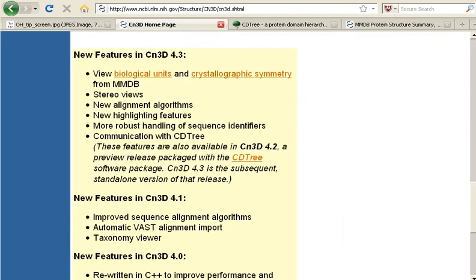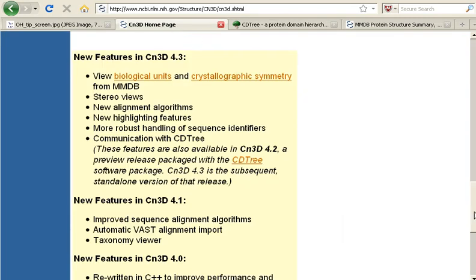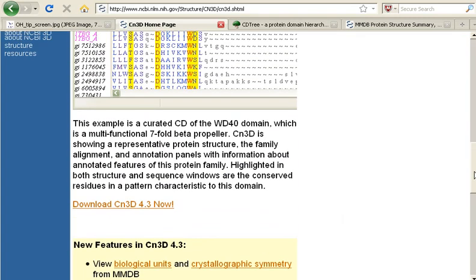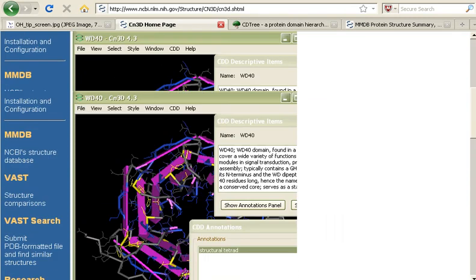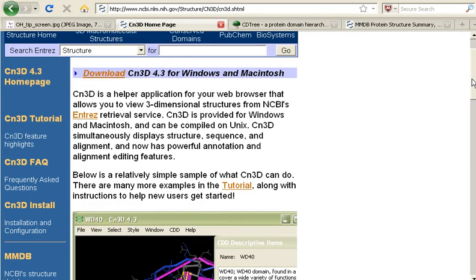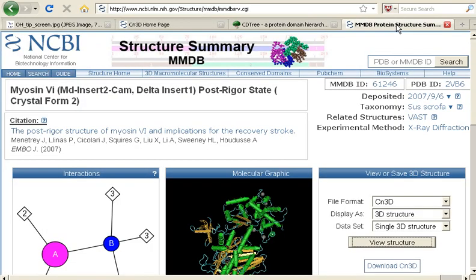CN3D is a visualization software that you can download to have on your computer. But how would you actually use this software? Well, that's what I want to show you today, along with a little bit about the updated software.